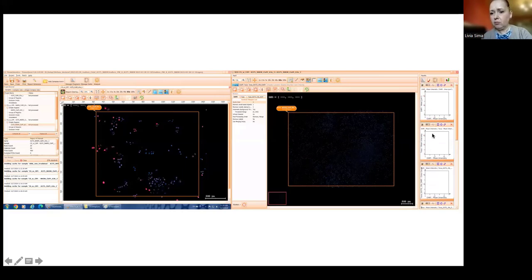On the right part, you have the scattergrams that are similar to the ones in flow cytometry, inspired by flow cytometry. Here, after the analysis of every sample, you will see dots that appear and correspond to values of your cells on each of the parameters that is analyzed.